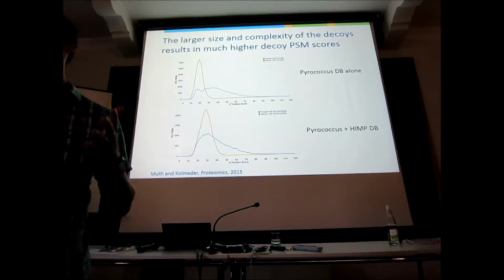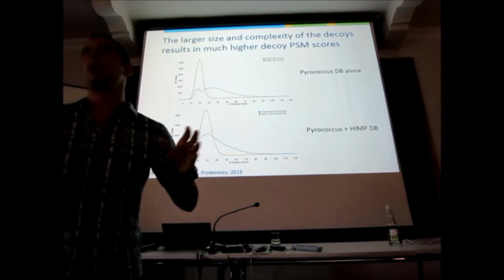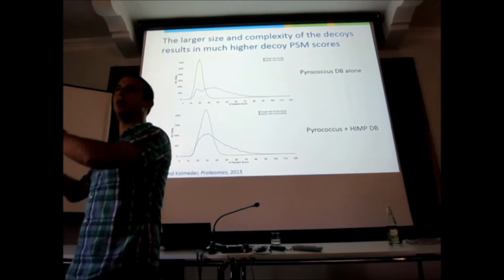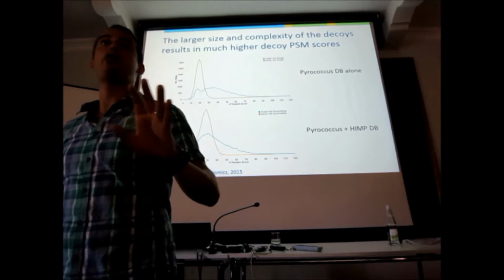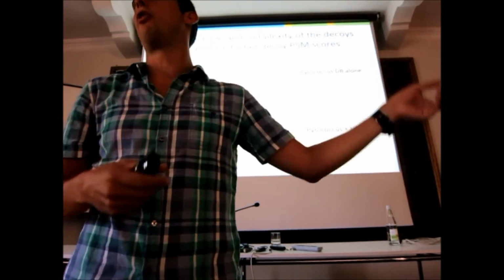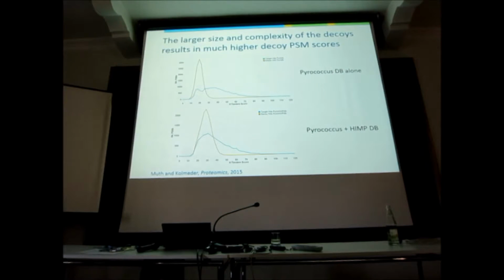It shifts because you now have, instead of, I don't know, 5,000 proteins, the equivalent of, say, 120,000 proteins. Imagine the number of different sequences in all of these proteins. So the sequence space is now enormous. When you make shuffled or reversed versions of this sequence space, you will find a lot of sequences that start giving you better hits than before. There's a lot more sequence diversity that gives you higher scores, and the algorithms are not built to compensate for that.